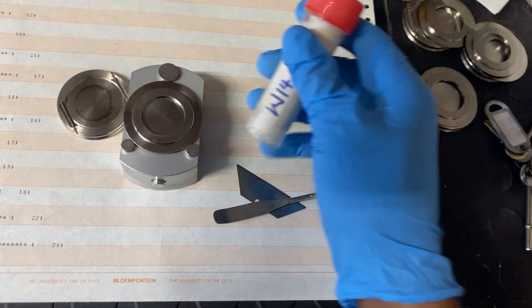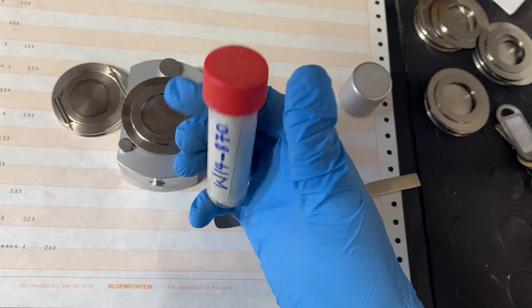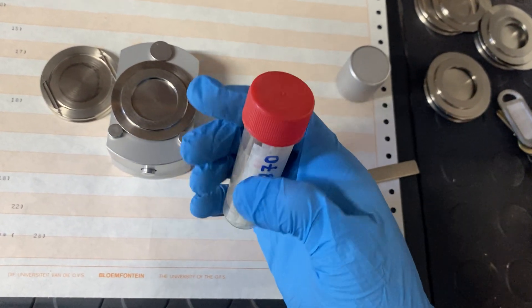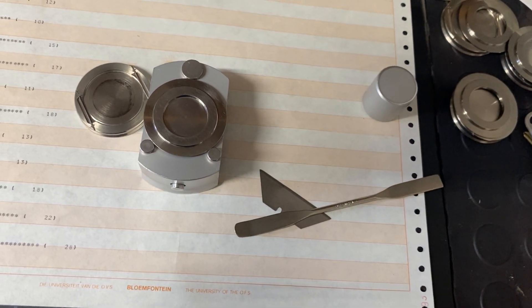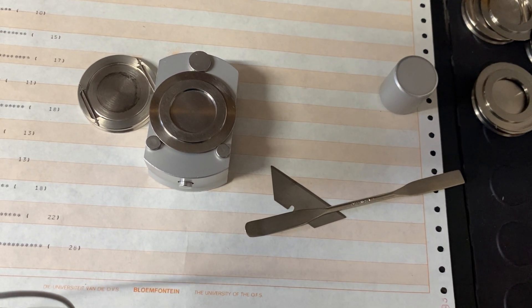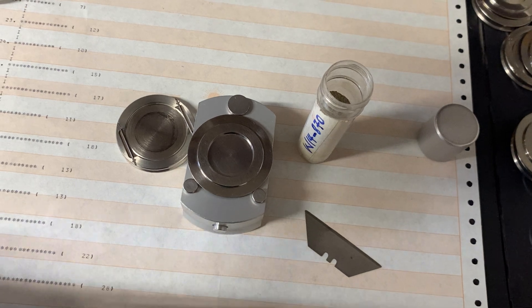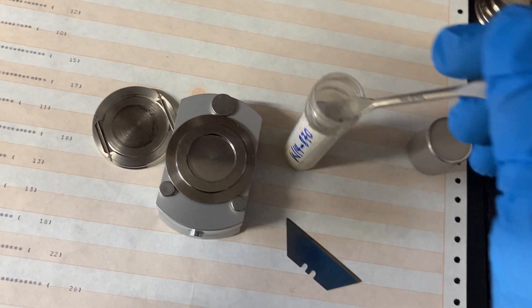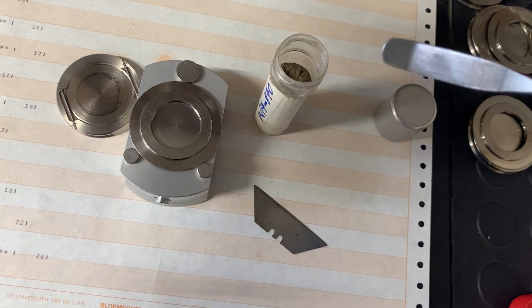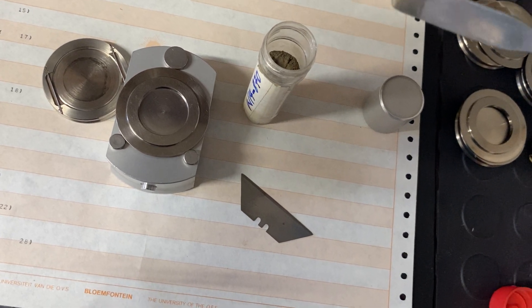Now take your well-labeled samples, ensuring they are in a finely homogenized powdered form. The quality of the powder is essential as it affects the accuracy of the XRD analysis. We then overfill the well of the sample holder with the powdered sample, and we try to ensure that the sample is evenly distributed across the well to avoid any inconsistencies during analysis.